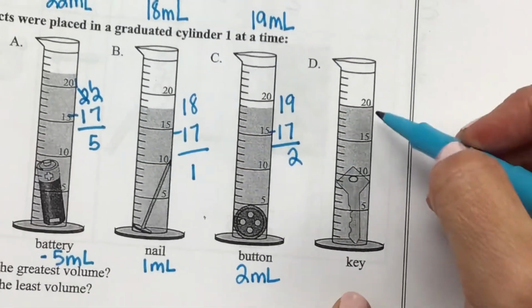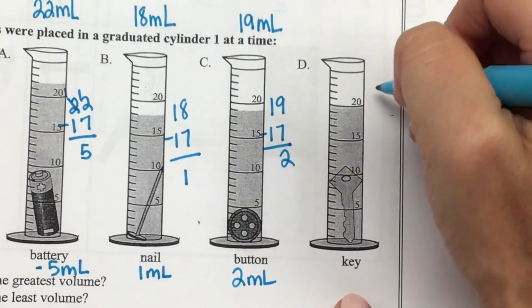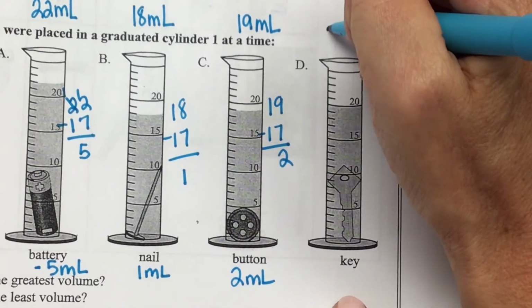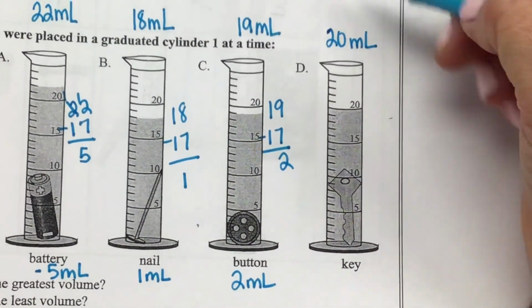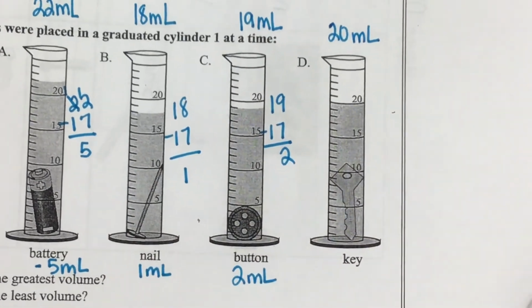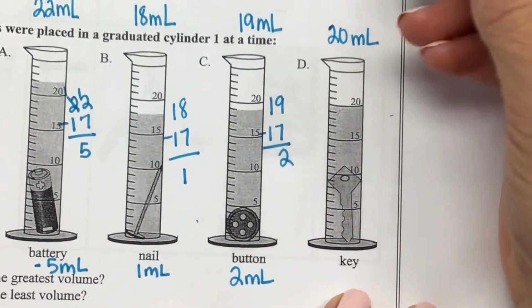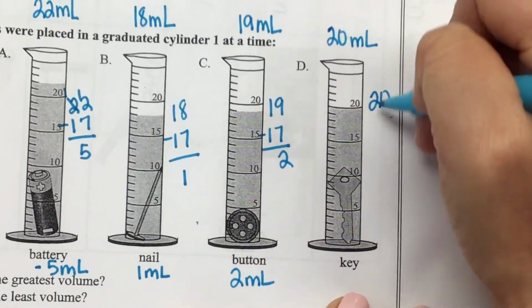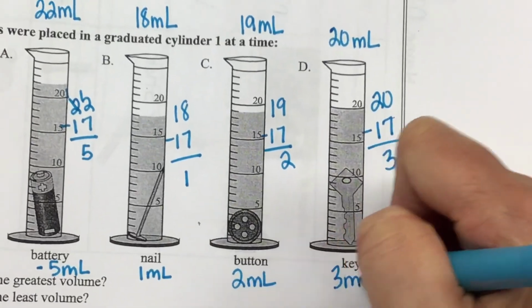Okay, what about this key? What did it rise to when they put the key in there? Avery? 20 milliliters. Okay, what is the volume of just the key? Caden? 3. It's 20 minus 17, and it leaves you with 3 milliliters.